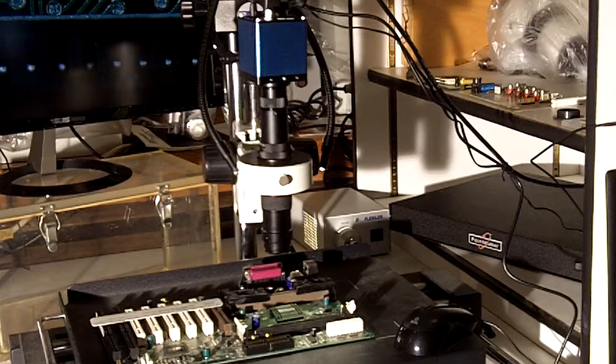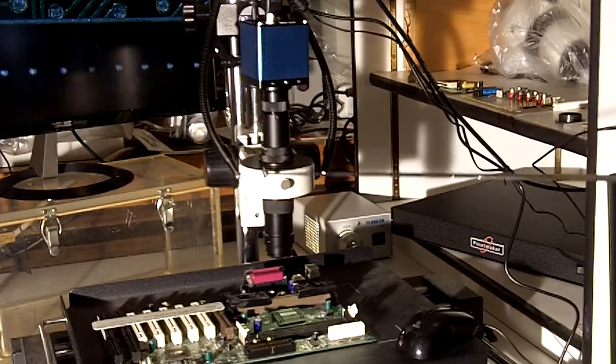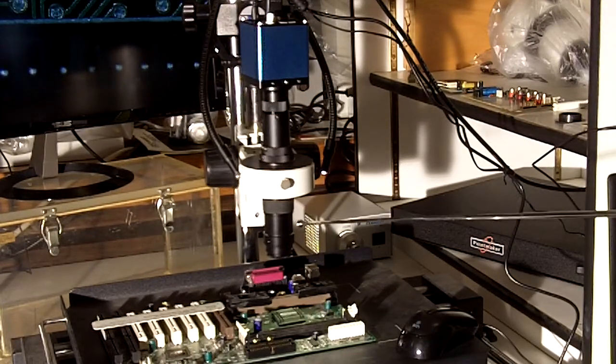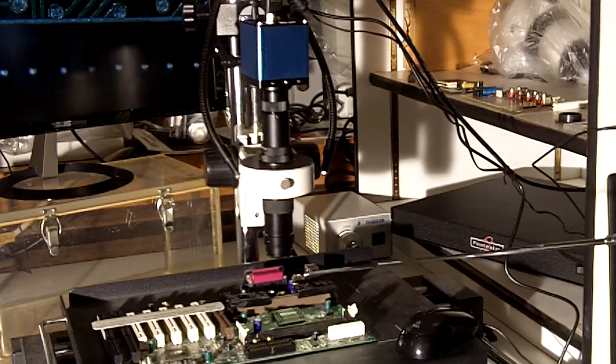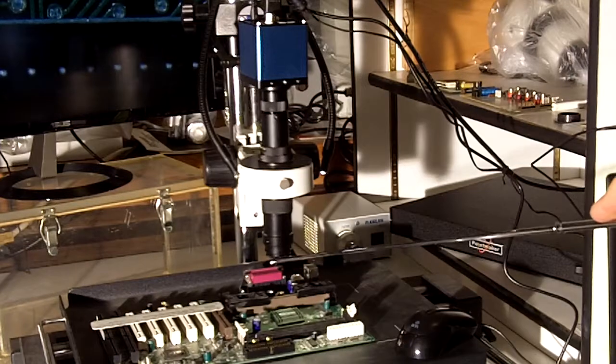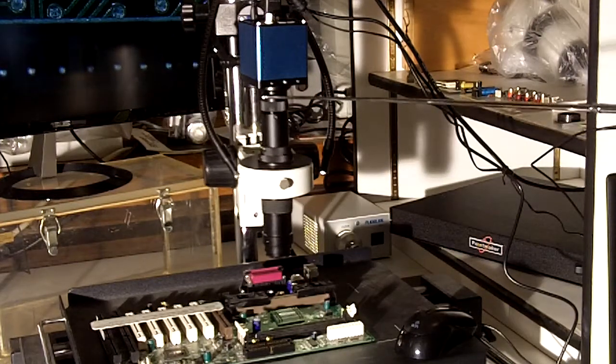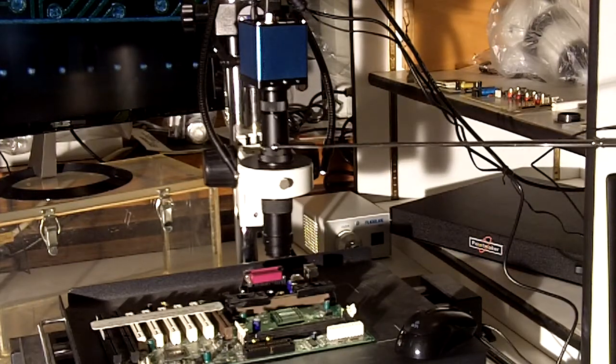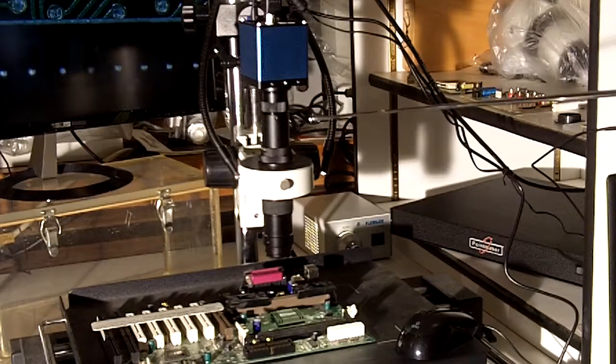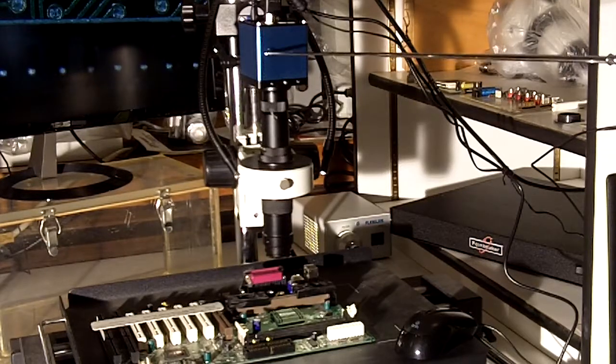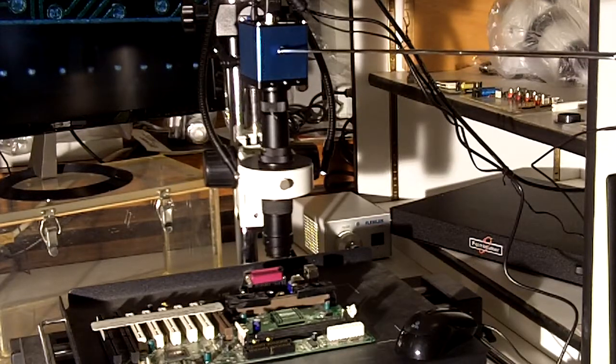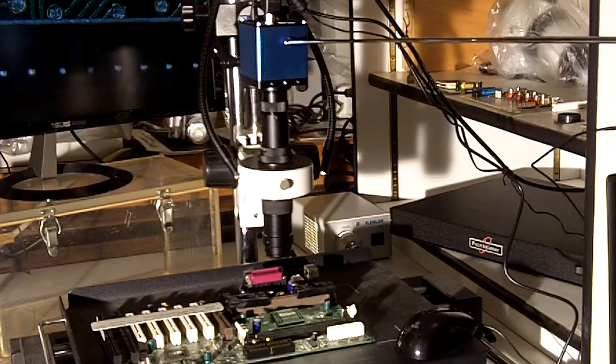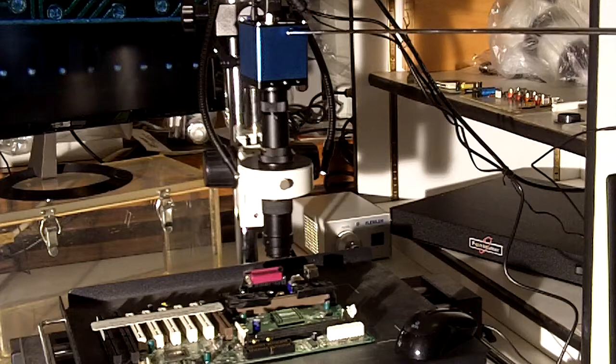The zoom system is a 6 to 1 zoom microscope which has variable front optics and variable C-mount back ends, but the most important component aside from the microscope is in fact the camera itself.